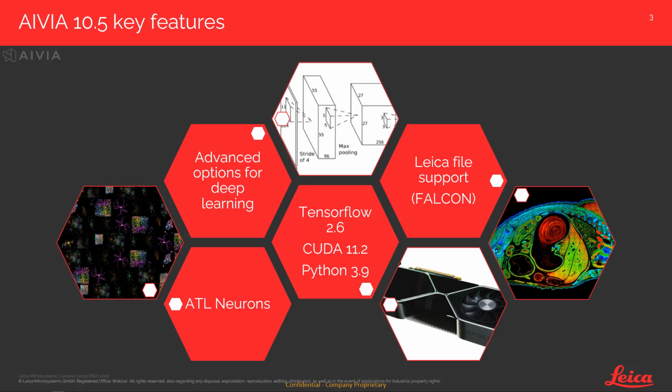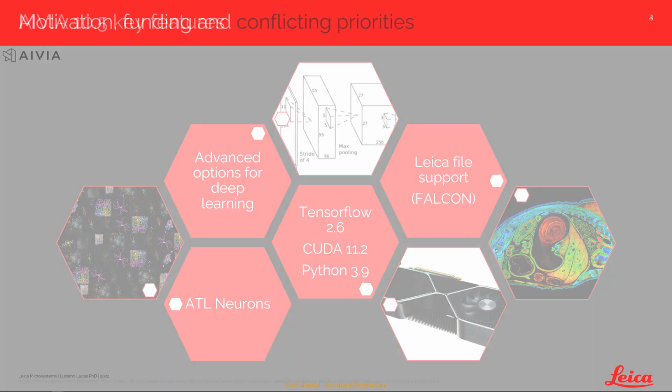In addition to this, I'll briefly touch upon some other developments. We've added a lot of new functionality for our train and apply pipeline for deep learning models. We've updated TensorFlow, CUDA, and Python, and we've added extended support for Leica file formats. In this case, we added support for the Falcon modality.